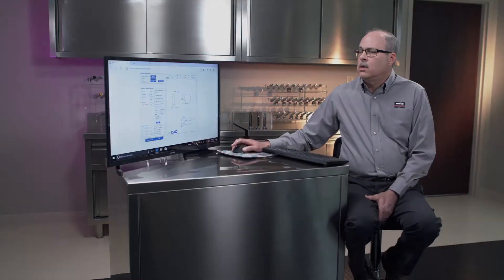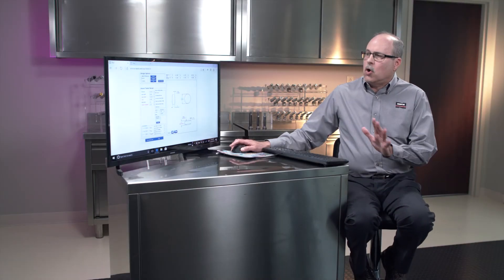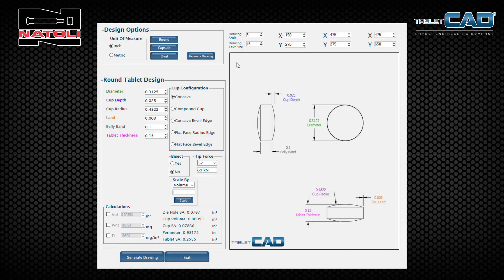Now let me provide you with a quick demonstration. This is your opening page for Tablet CAD. On the left-hand side of the screen is what we call the control panel — this is where you'll make your selections and inputs for the values of your tablet design. On the right-hand side is the display panel, where your tablet design will be displayed.